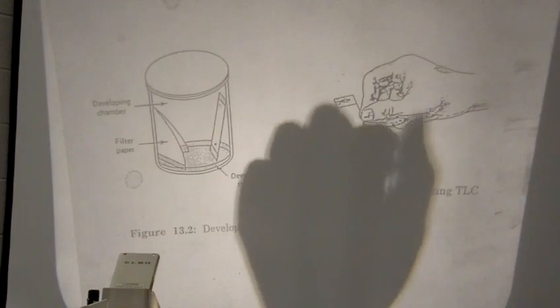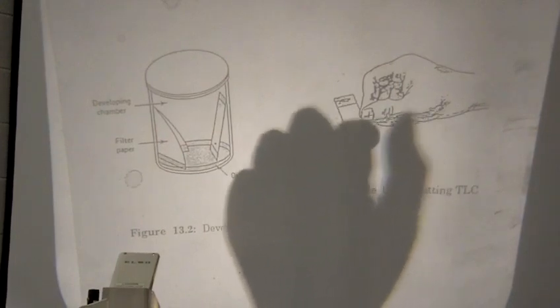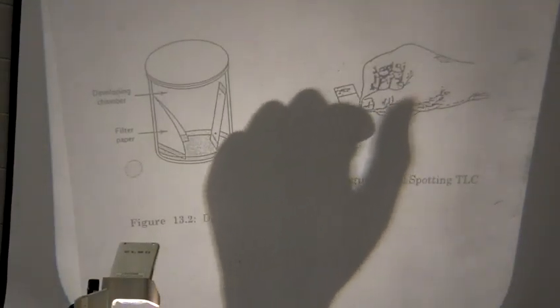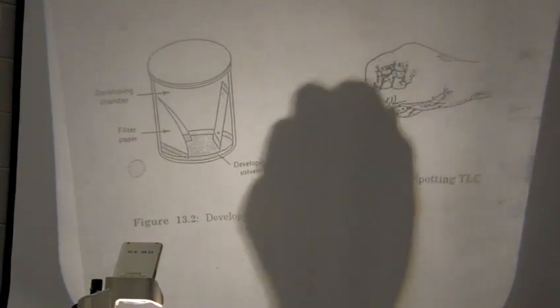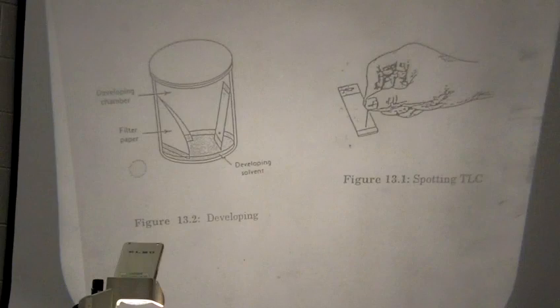It has silica on it. We already have lines drawn on the bottom; they don't usually come with lines drawn on them. You usually have to draw them on, but we've done it for you, okay? So there's a line where you're going to take capillaries, and we're going to teach you how to pull capillaries, and you're going to spot different things on the bottom of those TLC plates, okay? The reason you want the line is because you want to spot them at the same level on that TLC plate. I'll show you in a minute how we measure things, so it's important that everything's on the same level, all right?